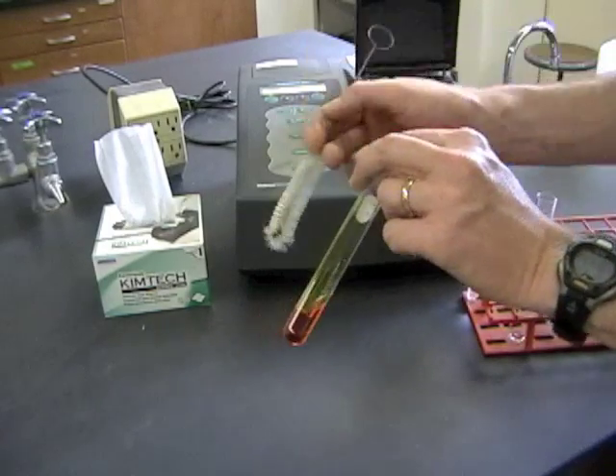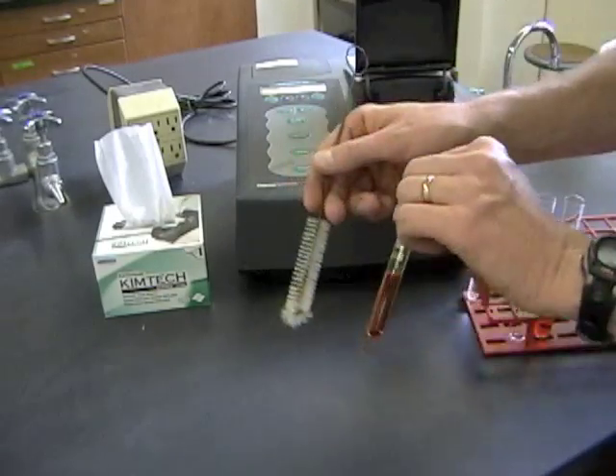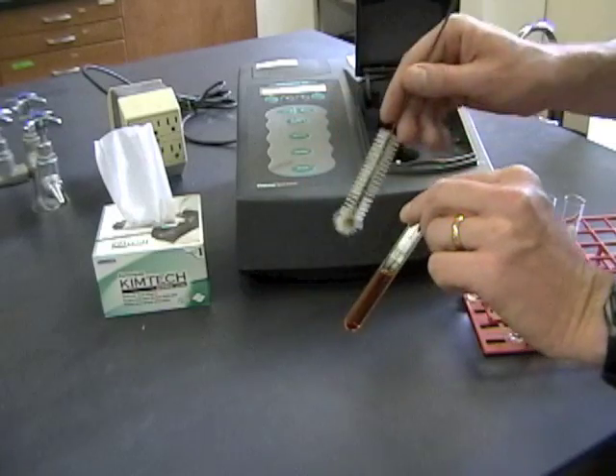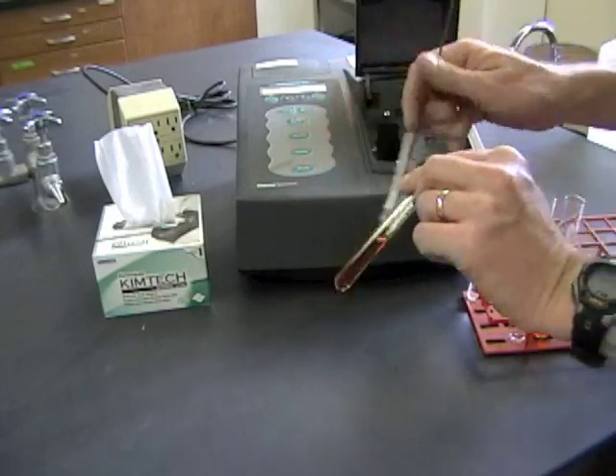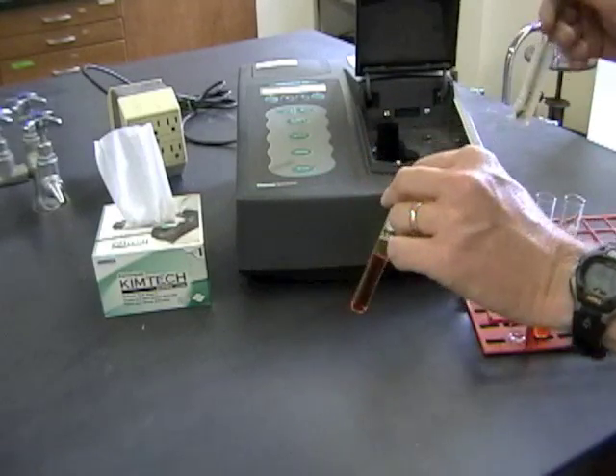With the big tubes, you can use one of these brushes at the sink to scrub them out and get all that material out of there. But do not use this brush on the spectrophotometer tube. If you try and stick it in there, it's going to scratch up the surface and that's going to make the readings inaccurate. So just dump it out, rinse it a couple times, and you'll be ready to use it again.